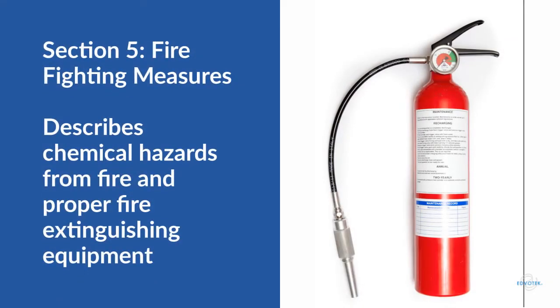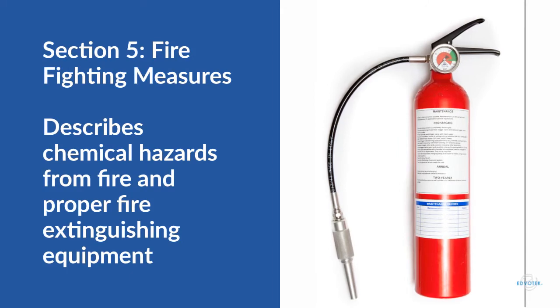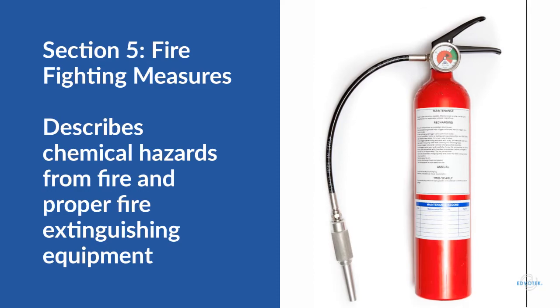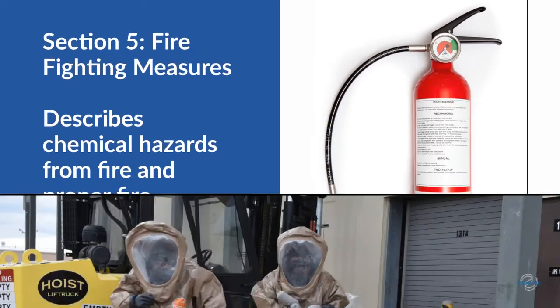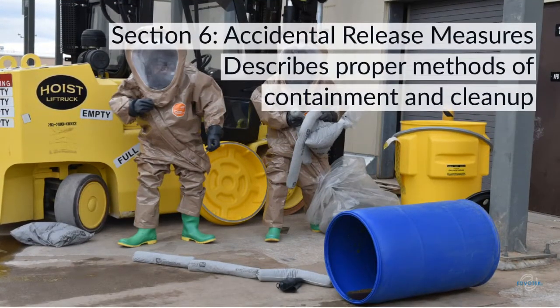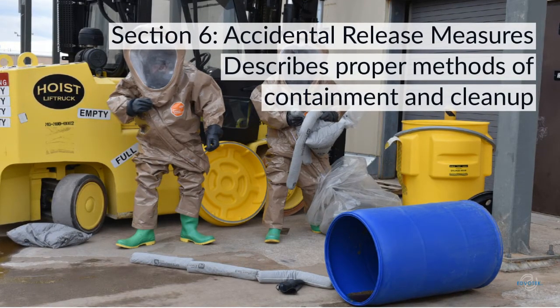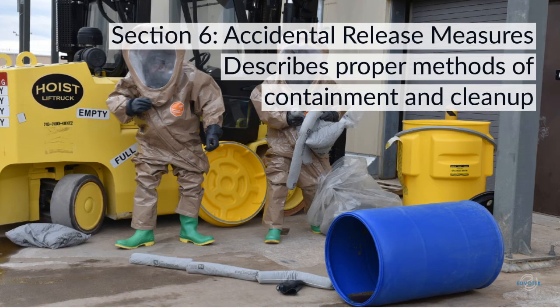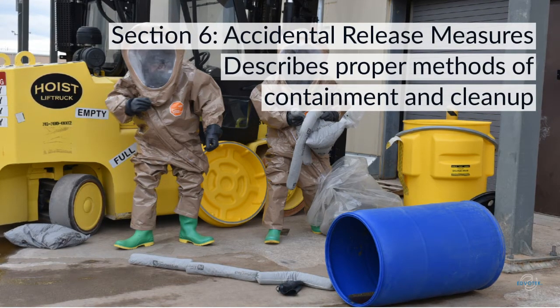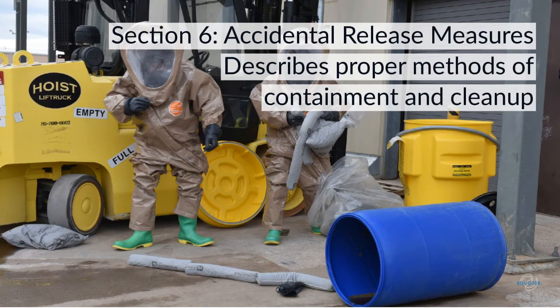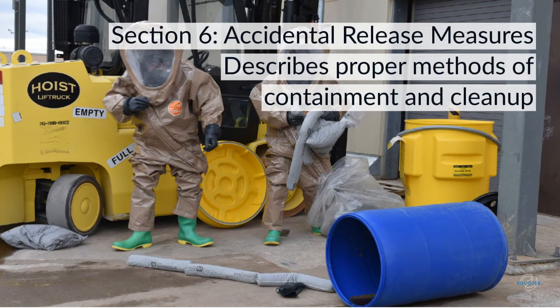Section 5, Firefighting Measures, details any potential chemical hazards from fire and lists suitable fire extinguishing techniques and equipment. If you spilled a chemical and wanted to know how to clean it up, you would refer to Section 6, Accidental Release Measures. This section details emergency procedures, proper personal protective equipment (PPE), and the necessary protocol for containment and cleanup.